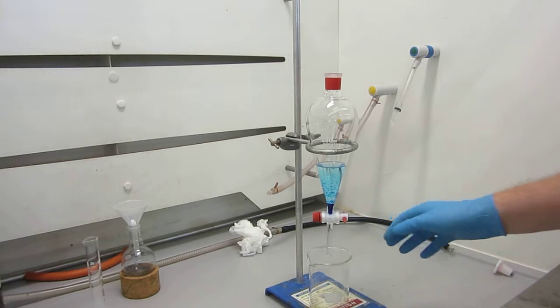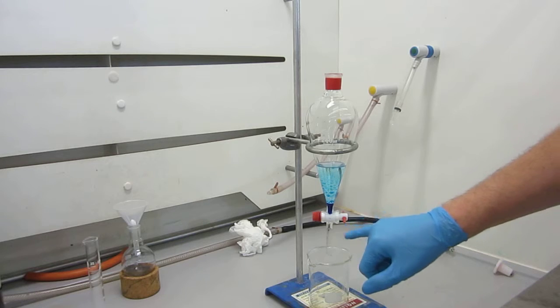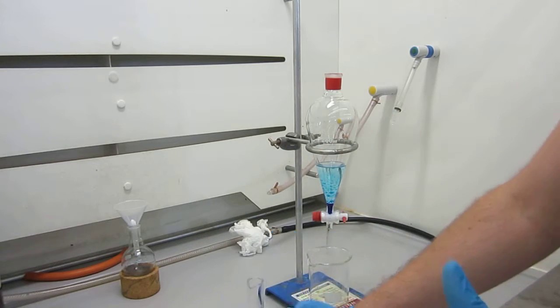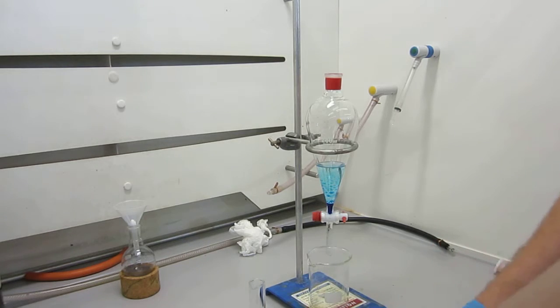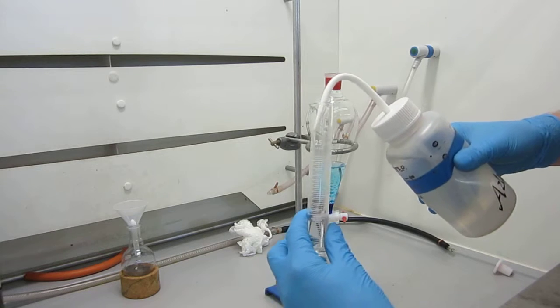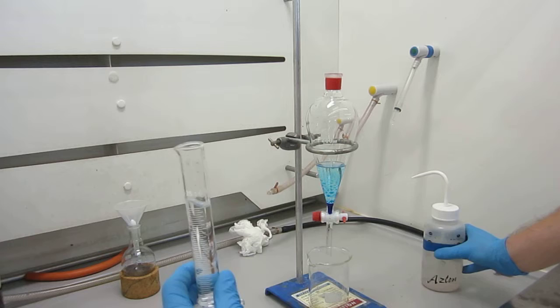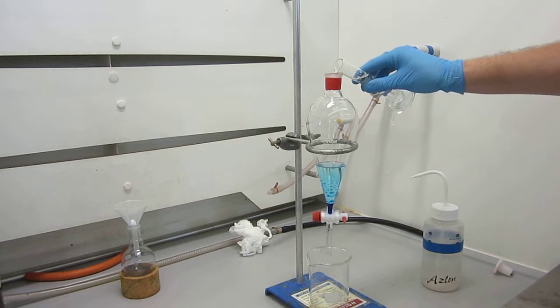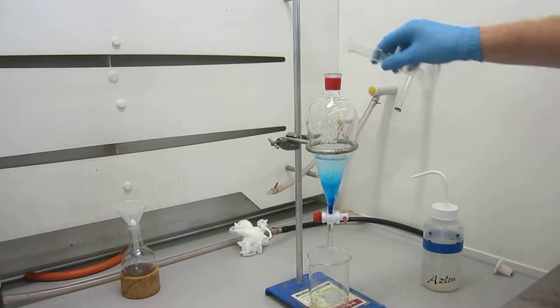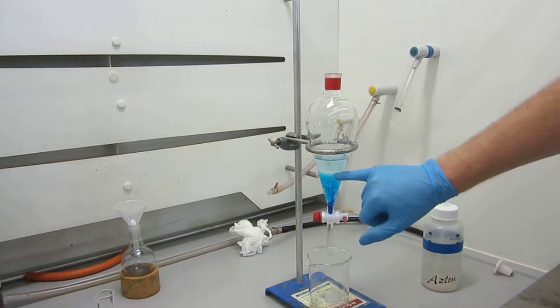So we've only really got one layer at the moment. The reason it's bulking up at the bottom is because our product doesn't want to be in the ethyl acetate. So what we're going to do is extract three times with 25 ml of water. So I'm going to measure out 25 ml of water. It doesn't need to be accurate, it's not an exact science. So there's about 25. I'm going to put that into my separating funnel. There we go. And you should see that now we're starting to get two layers form.